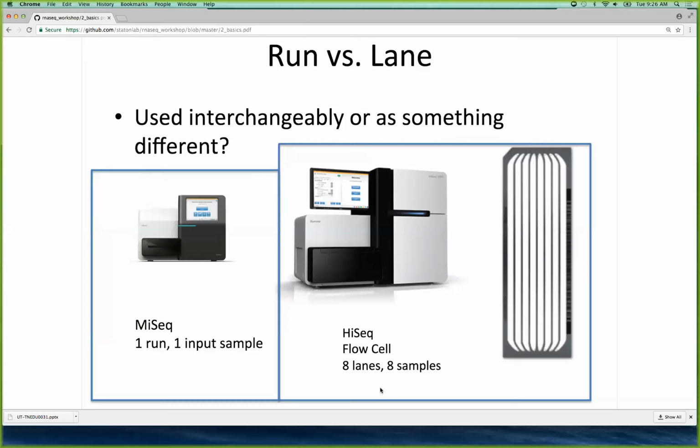Yeah, and I know you can. I mean, the amplicon 16S people, they'll multiplex 200 libraries on a MiSeq. So you can go up to really big numbers. I don't see that as often with RNA-seq, because normally you want the coverage as well. But yeah, for RNA-seq, probably you want more reads.